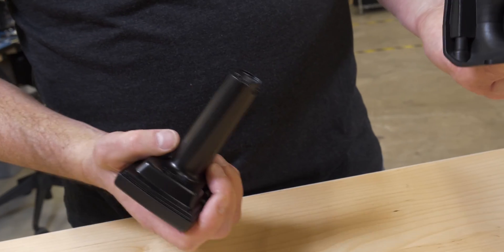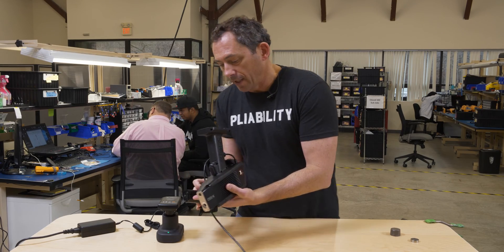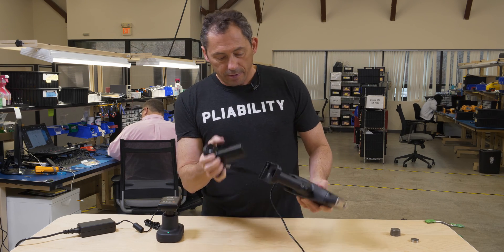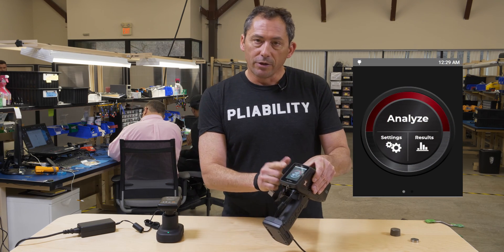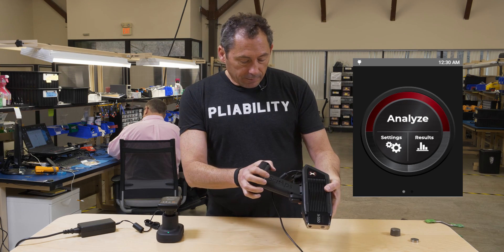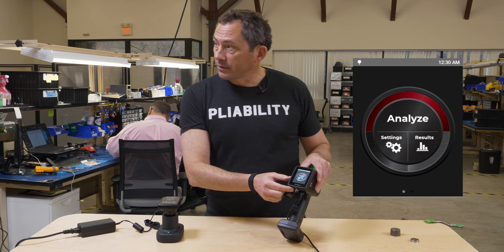Speaking of the battery, it's back here — you can pop it out of the unit anytime and pop it back in. It is keyed, so you can't put it in backwards. It's also a hot-swap battery, so as long as you put the battery back within a minute you don't lose power and you don't have to reboot anything. The back of the unit has the UI — it's all an Android system.